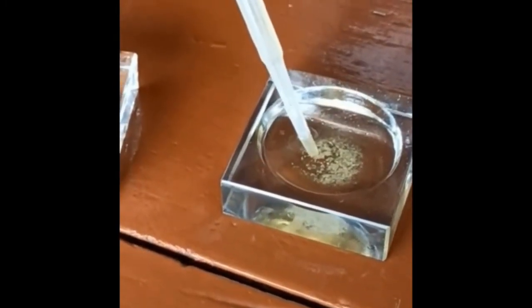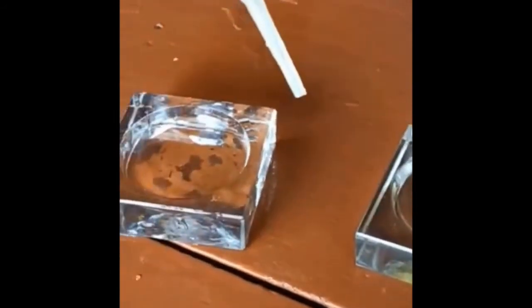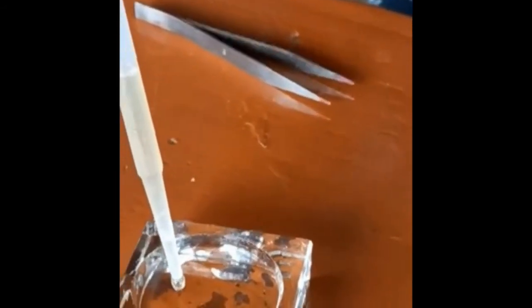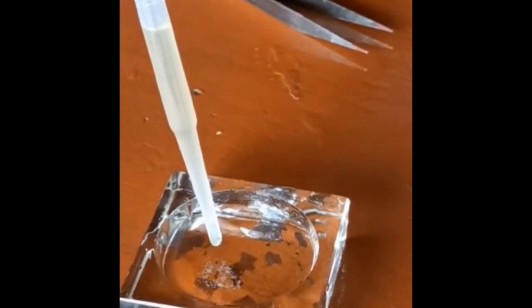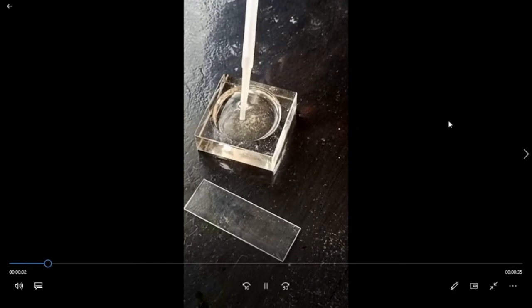Then we have to pour it into a cavity block, and for washing we have to collect the placoid scales with the help of a dropper. After collecting, we have to hold the dropper in inverted position so that maximum scales will gather in the lower drop. Then we will transfer it into another cavity block containing water for washing. Washing removes KOH from the scales. Here you can see that these small white granules are nothing but placoid scales.